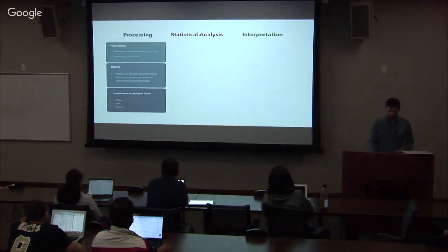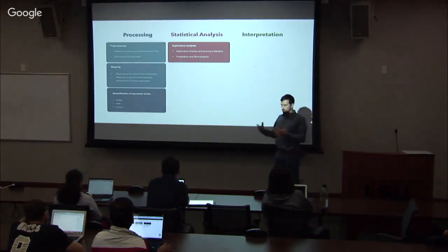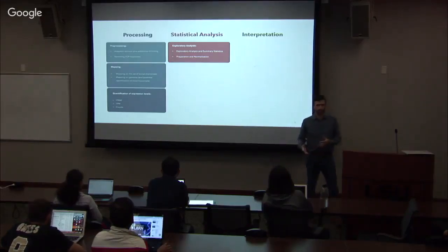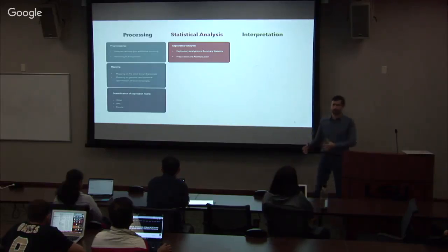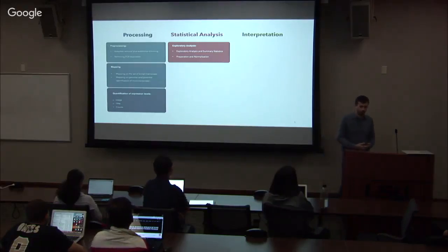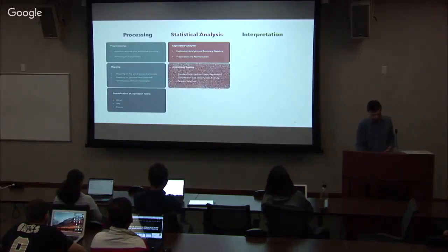For the statistical analysis, a lot of people tend to jump to hypothesis testing, and probably in a premature way, right? So that Tuxedo pipeline that goes all the way from mapping to differential gene expression lacks certain understanding and appreciation of data, its variation, and how we can normalize that data before we jump to that step. So we'll talk a little bit about exploratory data analysis. How do we explore those patterns in our raw data?